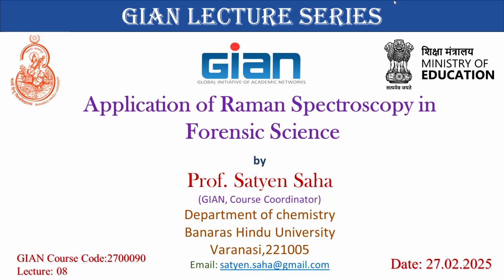So, welcome to this lecture. This is an application oriented lecture, application of Raman spectroscopy in forensic science. In the last class, I talked about the application of Raman spectroscopy in the medicinal field, and today we will be talking about forensic science.